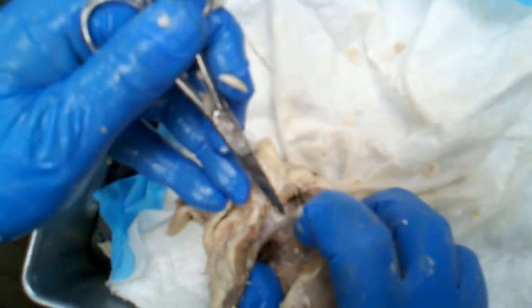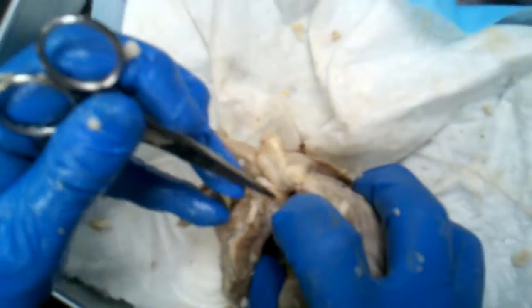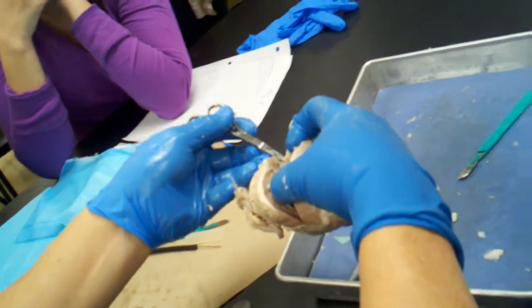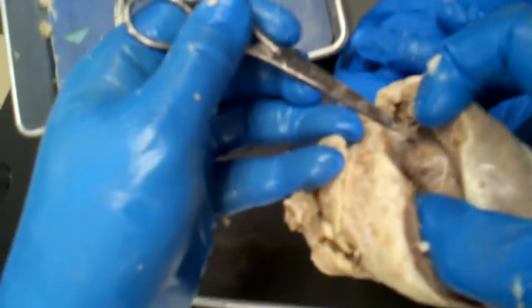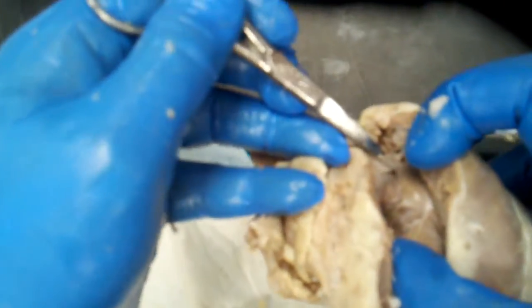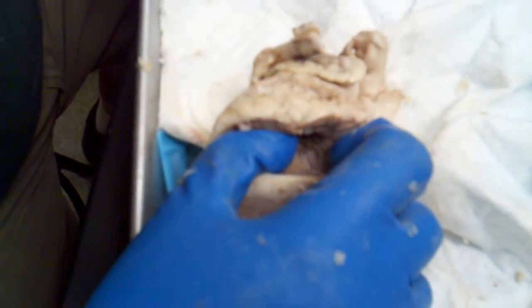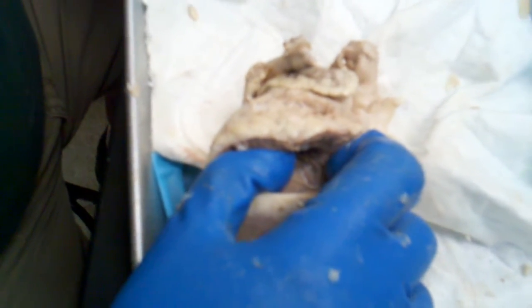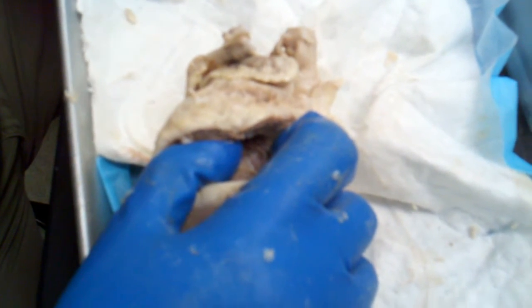What's the third one? Anybody? Third for what? Semilunar. He said there's 3. I only know 2. There are 3 flaps. Now that I move it, can you see that little flap that I'm moving? It's waving at you. There are going to be 3 of them. Which ones are they? I know the pulmonary and the aortic. I don't know the third one. Those are the semilunar valves. I only count 2. I think it means the valve has like three cusps. Okay. Got you.